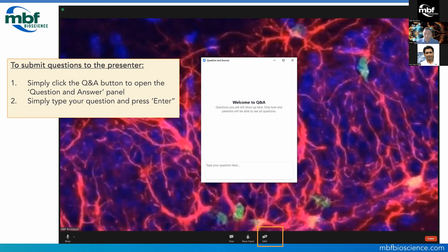Okay, I can answer that. Different clearing methods have different strengths. For example, the iDISCO method, which is good from the perspective of using antibodies to label, also ends up killing the endogenous signal from GFP and RFP and so on. But then there are other methods like CLARITY, which preserves these endogenous fluorophores very well. I presented several examples of the brains, right? Thy1-EYFP, Thy1-GFP that we image on a regular basis. So depending on that, it boils down to choosing the right clearing protocol.